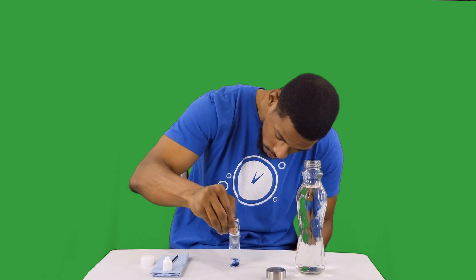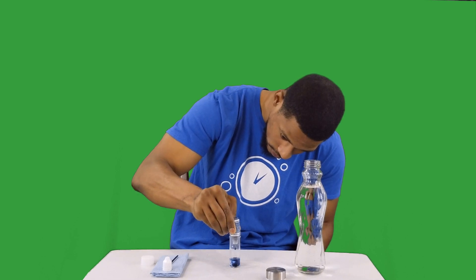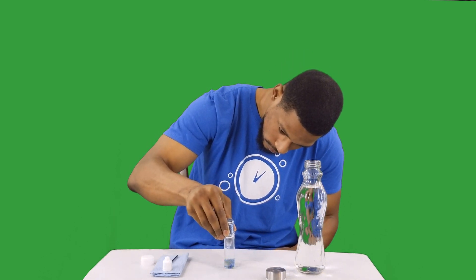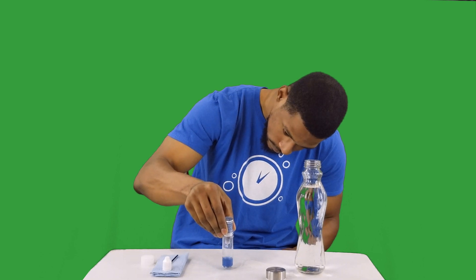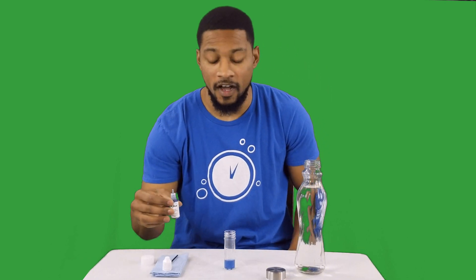Adding drops one at a time, counting each one: 1, 2, 3, 4, 5, 6, 7, 8, 9, 10... continuing to 15 drops total. Result: 1.5 ppm.